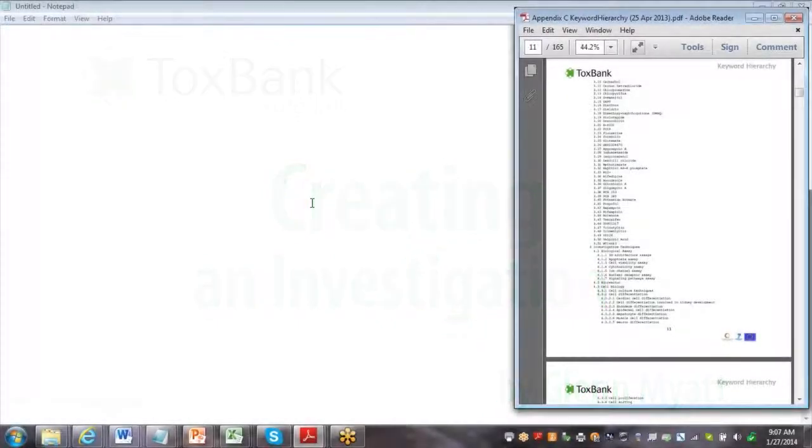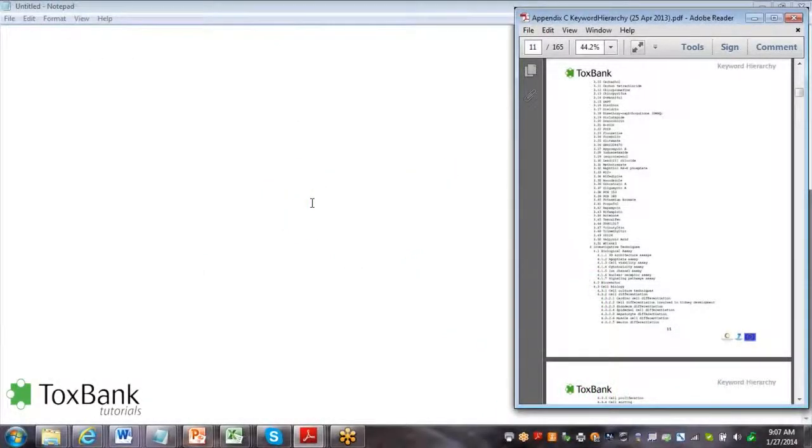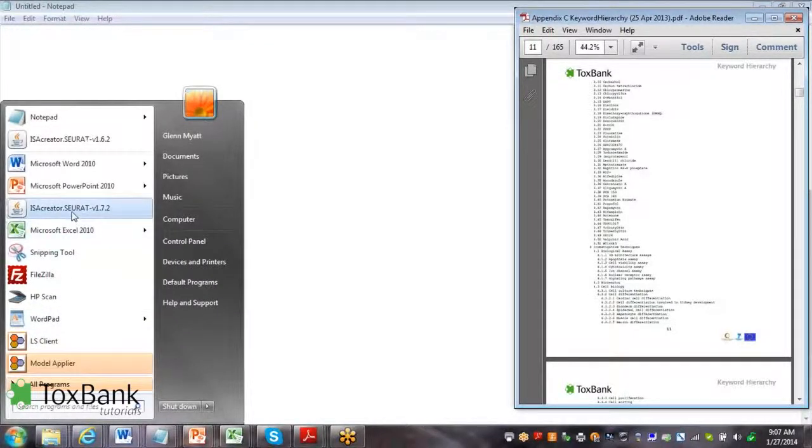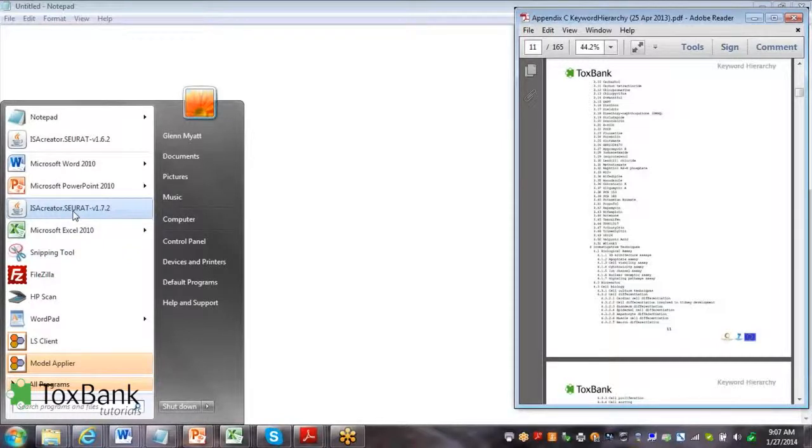The following tutorial is going to show how to create an investigation. The first step is to start up the ISA Creator software which is being downloaded from the Toxbank website.